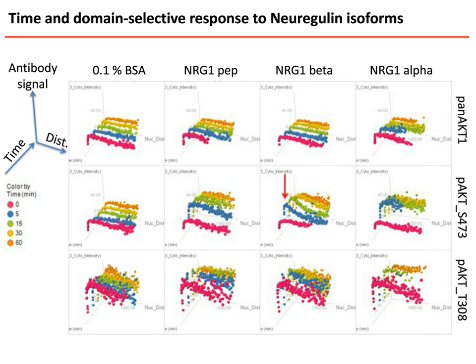Including in columns are the different ligands for the system, and in rows are the outputs. So these are the measurements in rows. And here we're incorporating 3 domains into each box of this large plot.